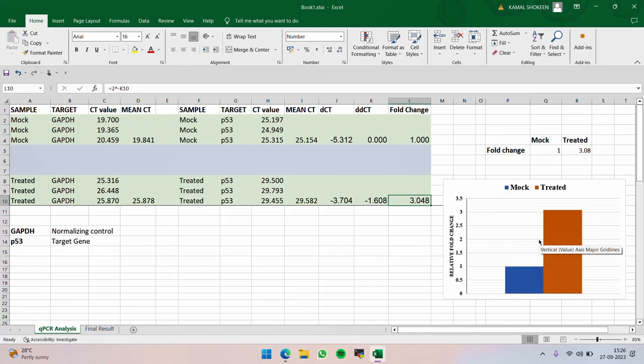We are isolating the mRNA from the cells. Then we are reverse transcribing it to cDNA. And we are using that cDNA as a template in this reaction. Yes, we are not isolating it further. No, we are not removing anything. This is a one step reaction.